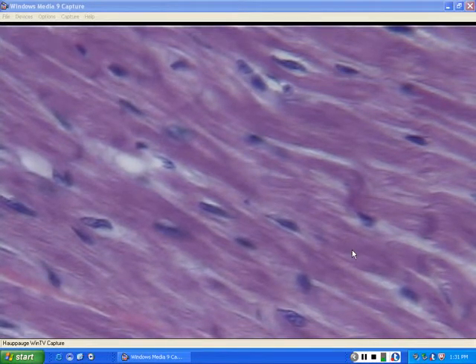So this is what's responsible for forming the thick muscular walls and muscular nature to the heart muscle itself, and is the only place in the body it is located. And we'll move on to the last one that has a few more locations in the body, and again, this muscle can be thought of as an involuntary muscle. This is one that moves without us necessarily having to. We don't have to think heartbeat, heartbeat.